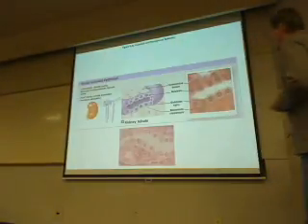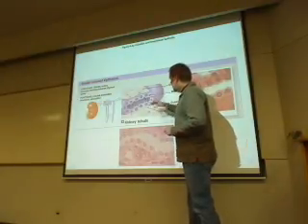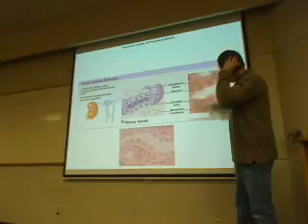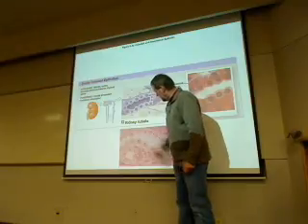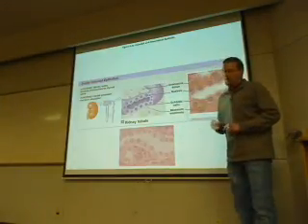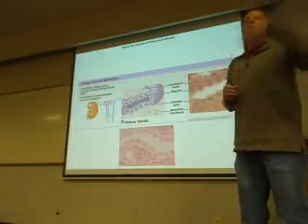So the next guy you have is simple cuboidal epithelium. And with this one, as the name implies, it's a single layer of cuboidal cells. So when you take a look at this picture down here on the bottom of this picture up here, they did a really nice job finding cells that have kind of a cube sort of shape. So when you take a look at these guys and they're saying that they're cuboidal, remember that the name is kind of representing some kind of shape.